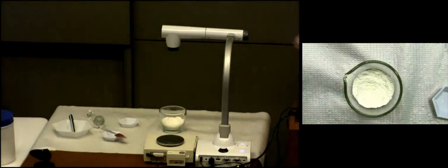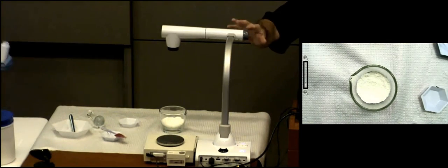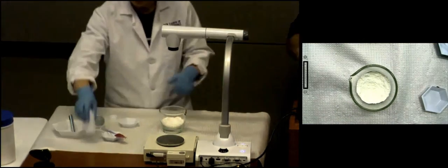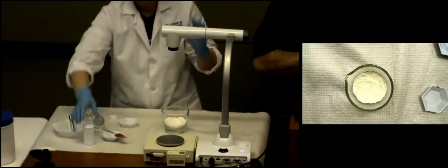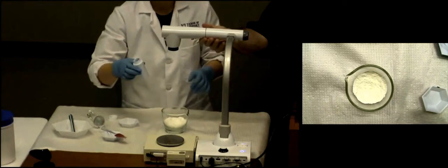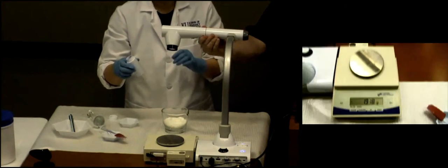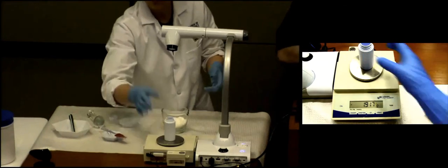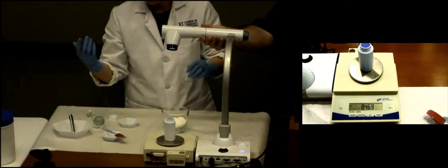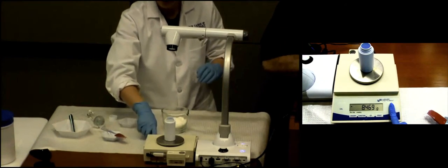Okay, so we are ready to transfer. Then we will be ready to dispense, right? You don't want to dispense to a patient in a bowl like this. So we're going to use a shaker bottle. Are you going to do that? Oh, yeah. All right, so make sure that you tare with your shaker bottle, because I don't want the weight of the bottle, but the weight of the powder. So tare with the bottle.